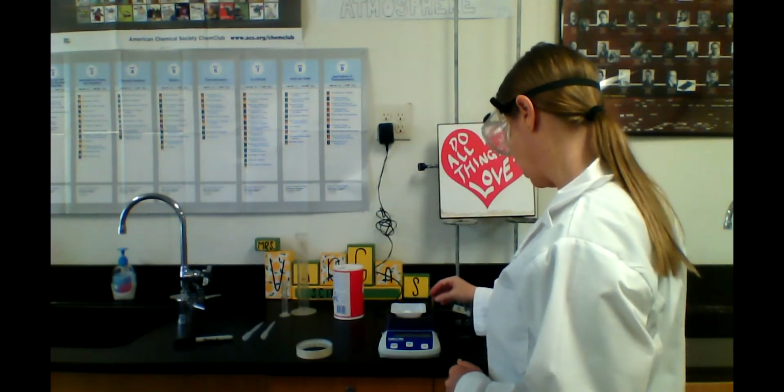We're at 21, 22, 23, 24, and let's get as close as we can to 25. 24.99 is pretty good. So we should record that we used 24.99 grams of sodium chloride.